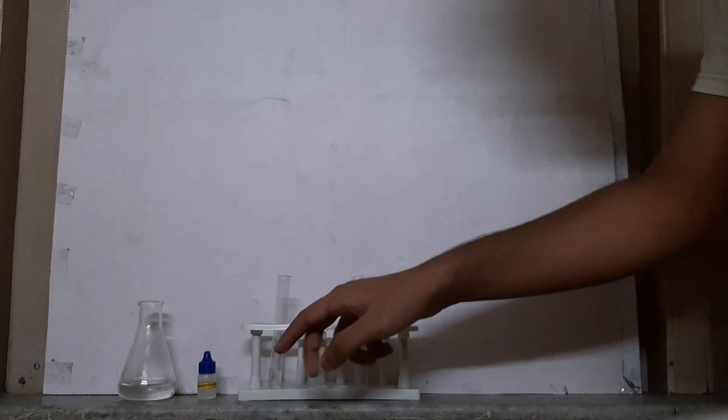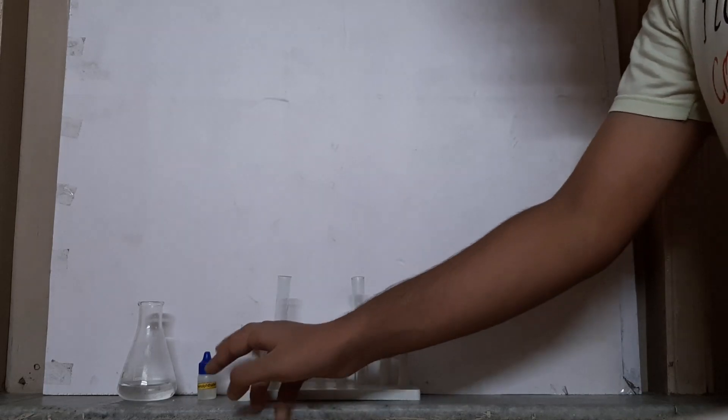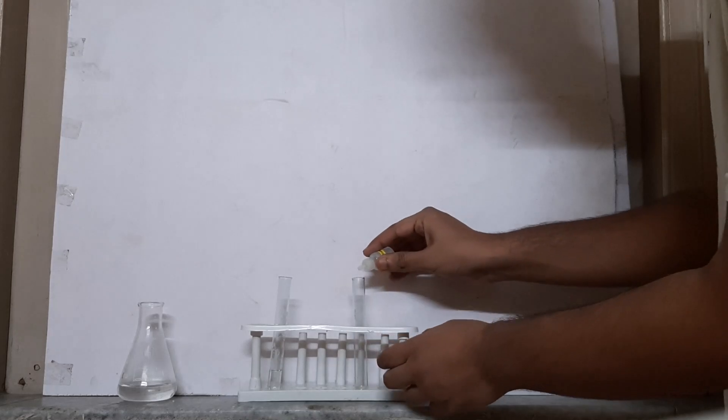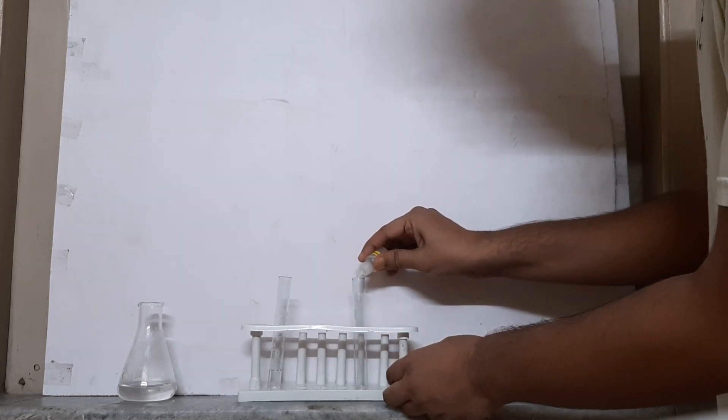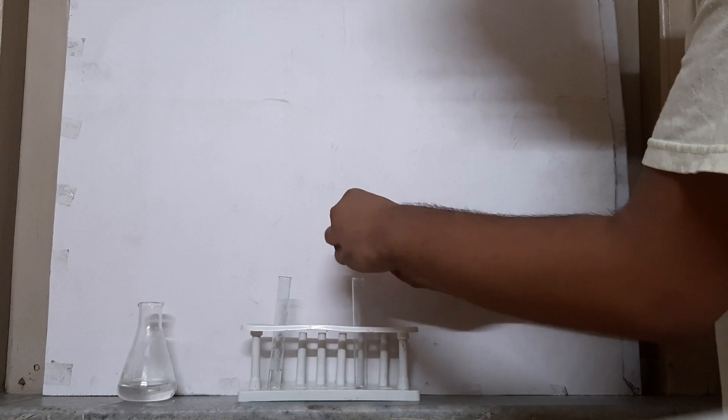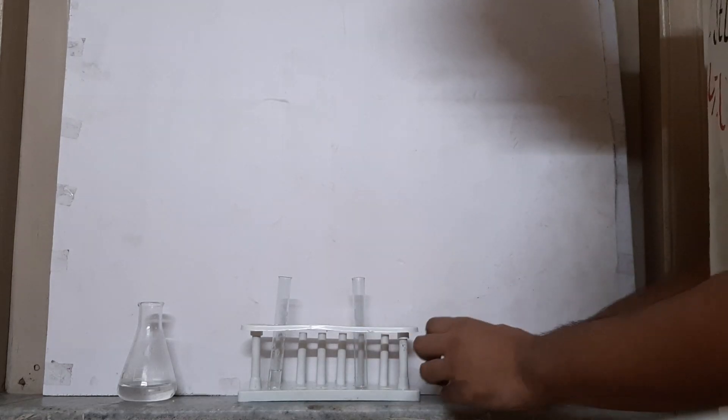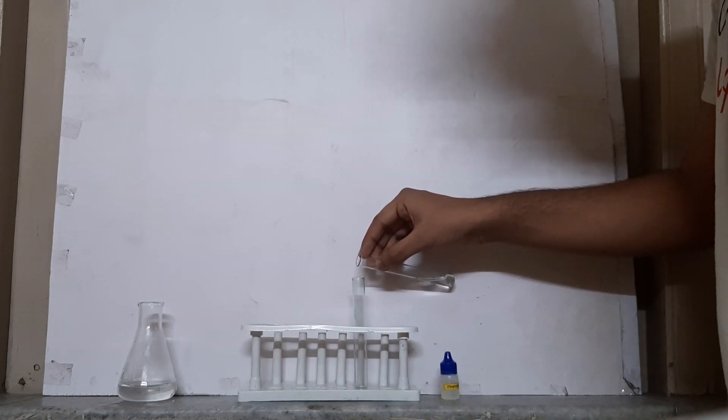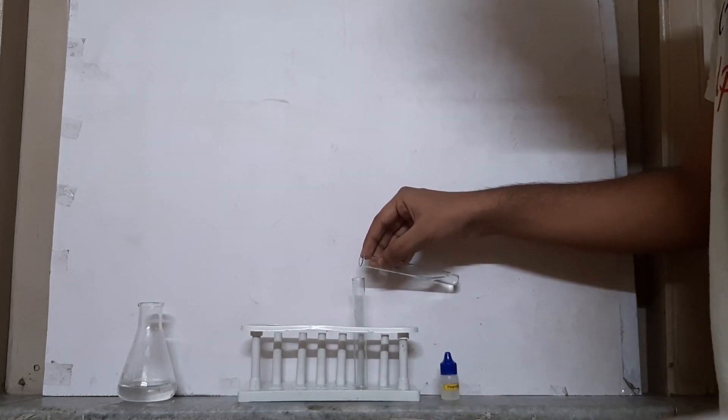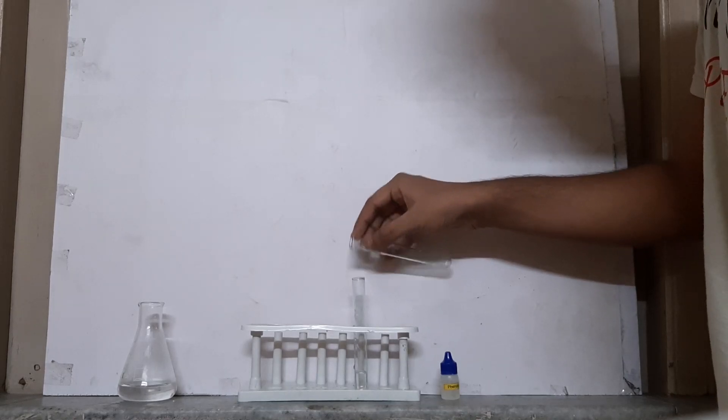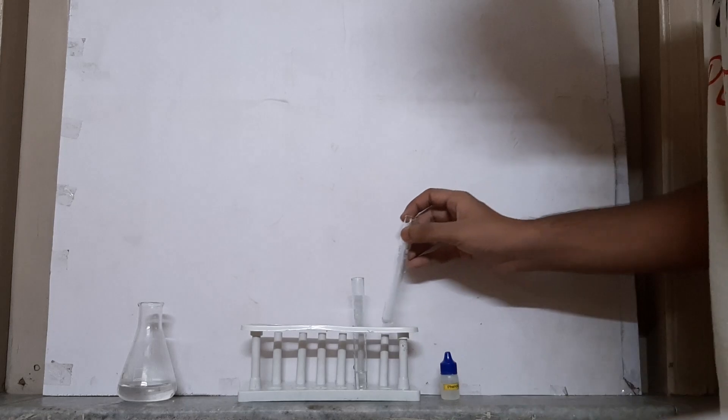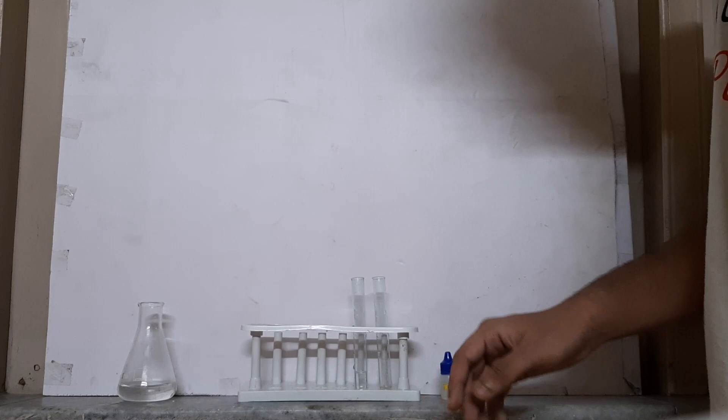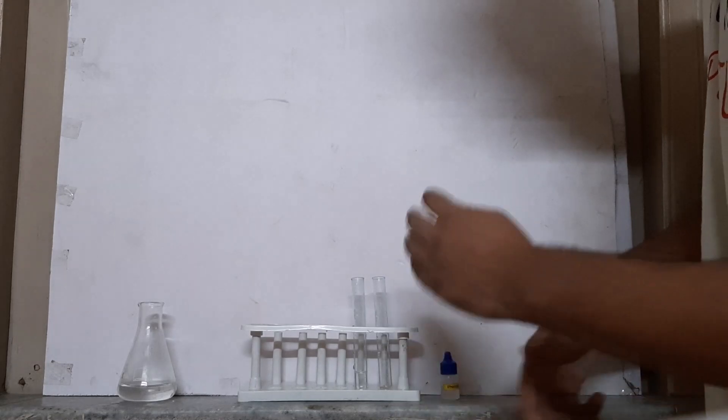First I'm going to add some phenolphthalein solution in the spare test tube, and then I'll be adding the HCl solution. We'll see if the color turns something or it just remains colorless. The solution is very clear, it is colorless.